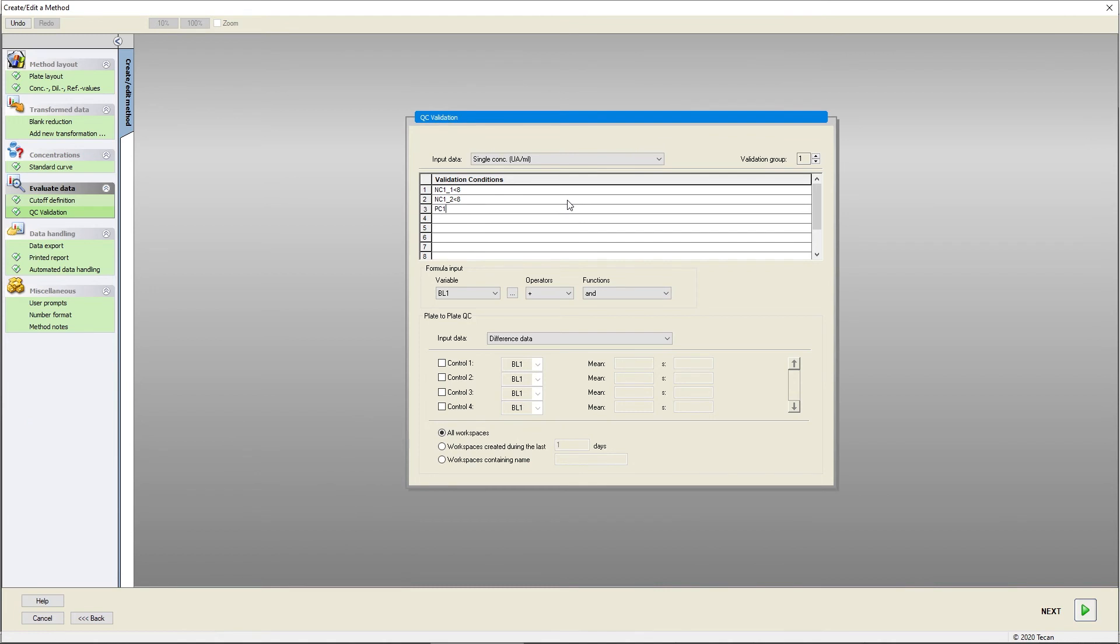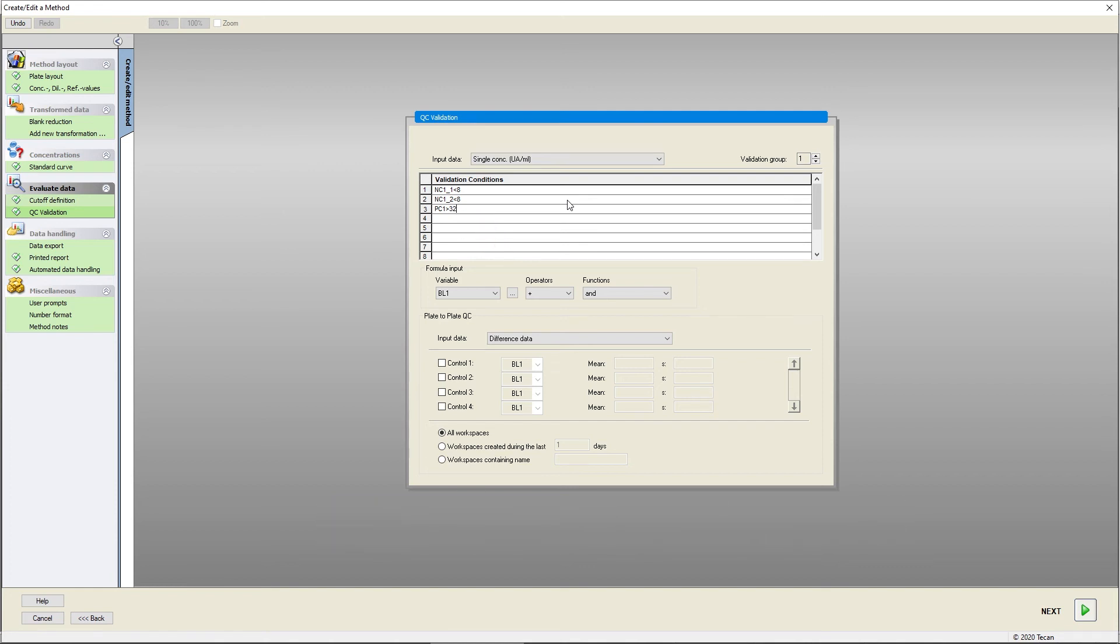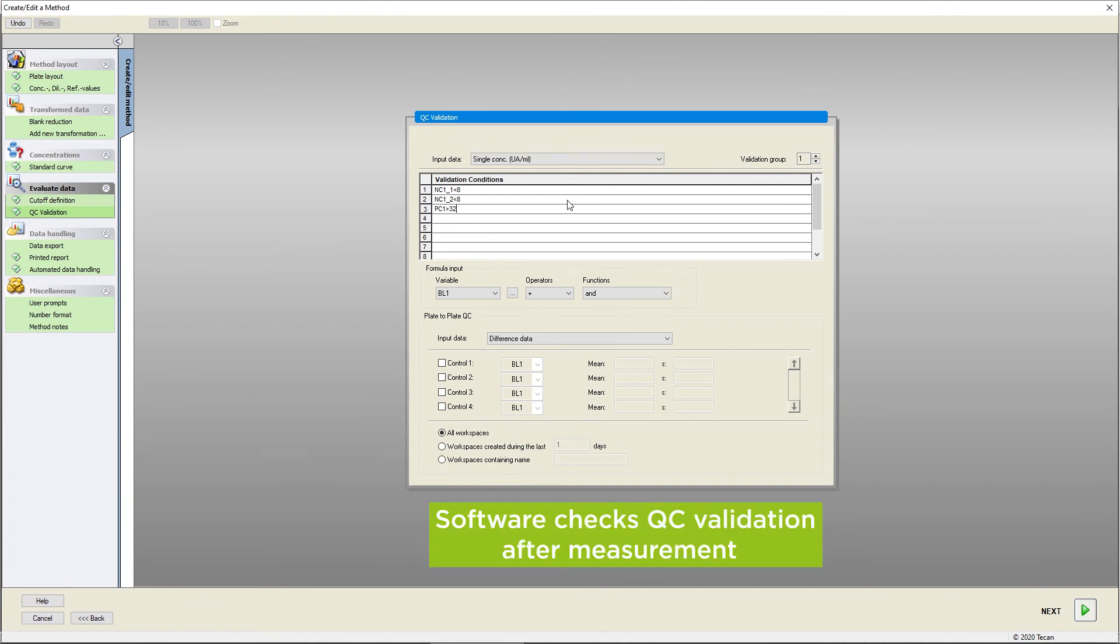Instead of single values, you can also use the mean value of the controls. Here, the mean value of the positive controls must be above a certain concentration value. The software will check the QC validation after the measurement.